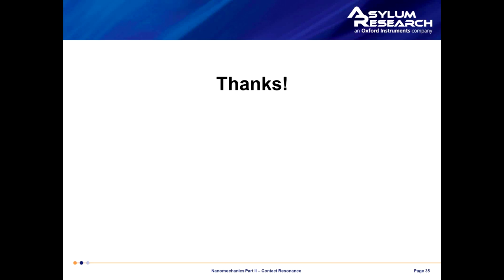All right, thank you. Roger, then, a question. How do you glue the sample to the actuator, and isn't the amplitude too low for very stiff materials? And then an additional question about damping of the actuator. Can you just add a very heavy mass to the actuator to eliminate this forest of peaks effect?